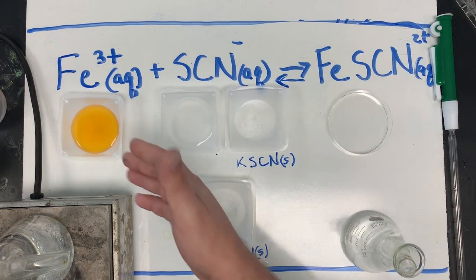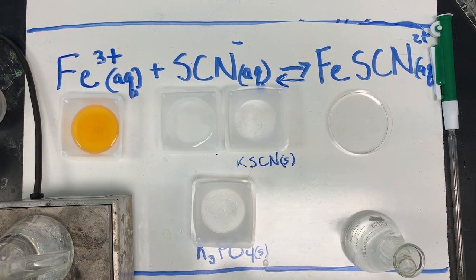Okay, we're going to go ahead and start our reaction. In the first dish, I have aqueous iron 3 plus. The spectator ion is nitrate, so nitrate's also there.